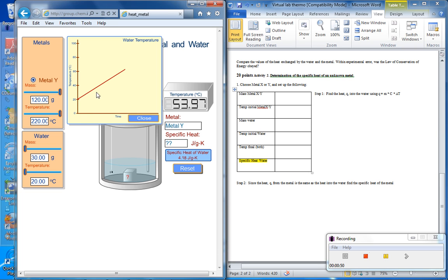Notice how the temperature continues to go up because we had a really high temperature here, so it goes up and up and up, and eventually it stops. Aha! It goes constant, so we're going to have to pick the right number here. It varies from 82.97 all the way down to 82.93. So we'll look at the middle of that.